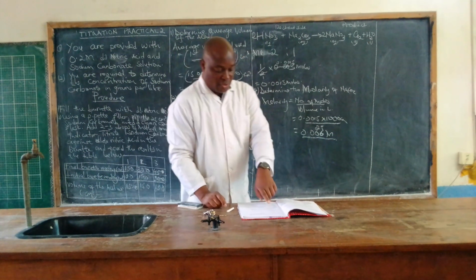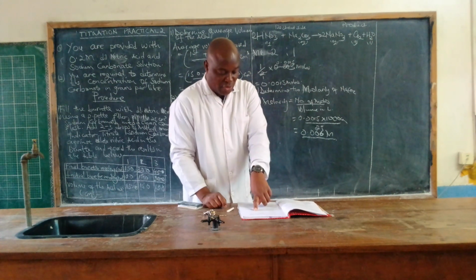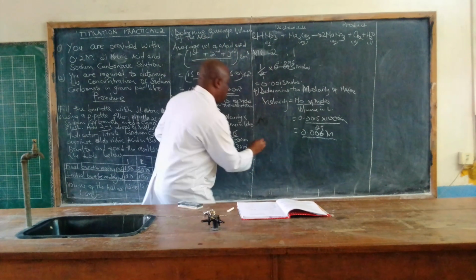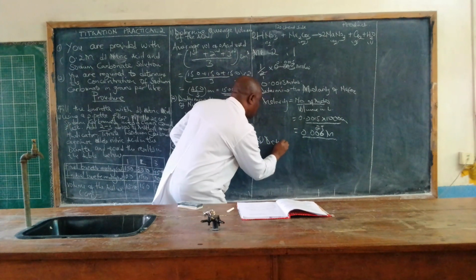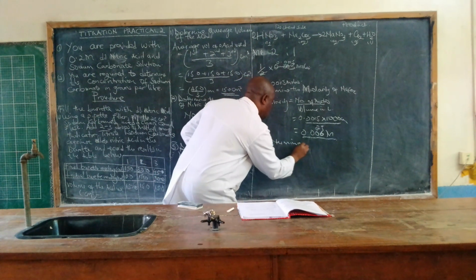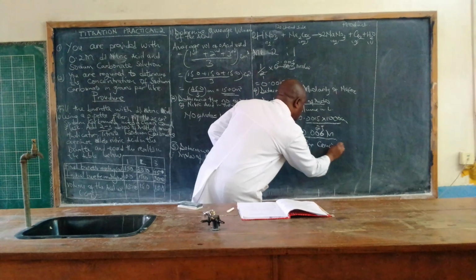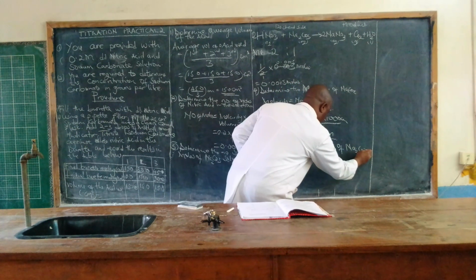Next, we have been told to determine the concentration of sodium carbonate, number 5.